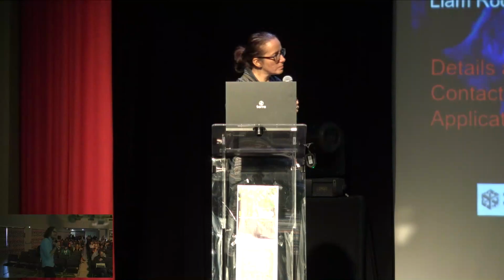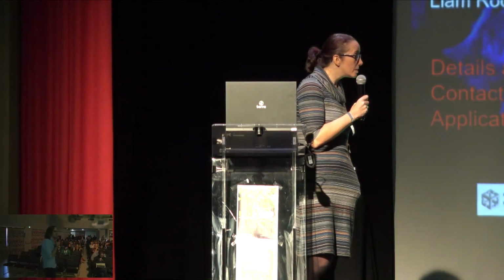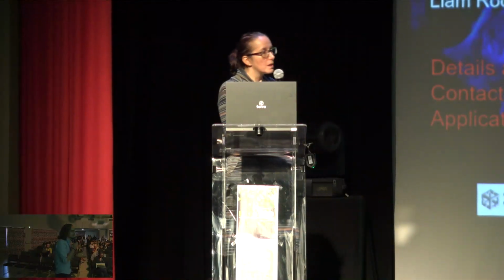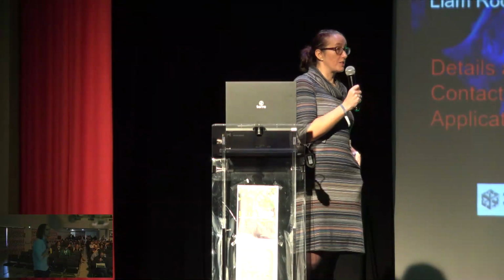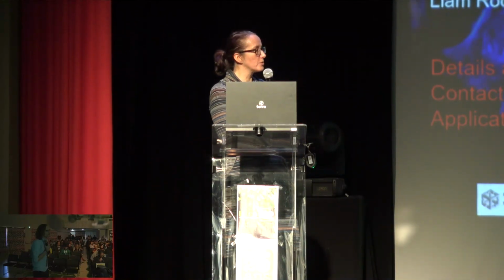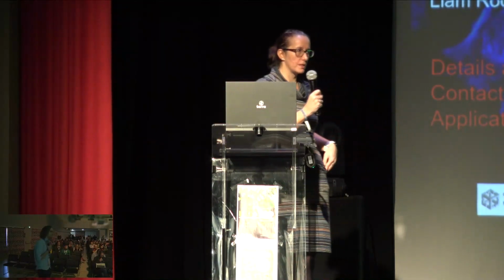And it's not an issue with light sheet to have such a small depth of focus? Sorry? Usually in light sheet you want quite a large depth of focus to get rid of the alignment issues, or? Yes, we would love to have a big depth of focus, or depth of field here, because that would simplify all of our setup. It's difficult to align, but once it's aligned, it works perfectly. So yeah, it's good.